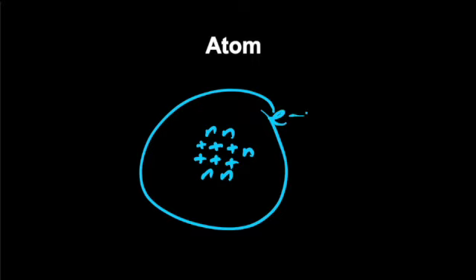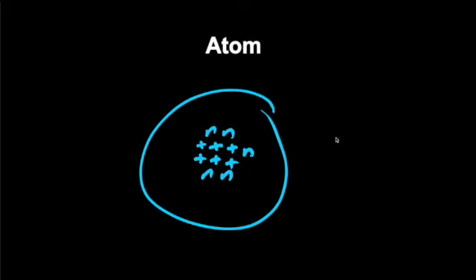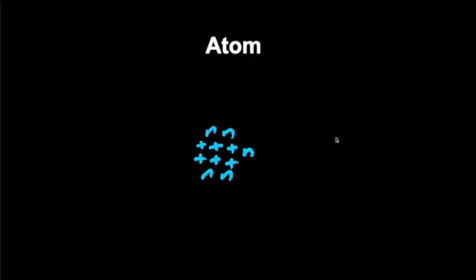And of course there are electrons for a neutral carbon atom, 6 of them, on the outside of the atom. In NMR, because it's nuclear, we don't worry about the electrons. We're going to strip away those electron clouds, just strip them away, and we're going to look at the atoms inside of our molecule.